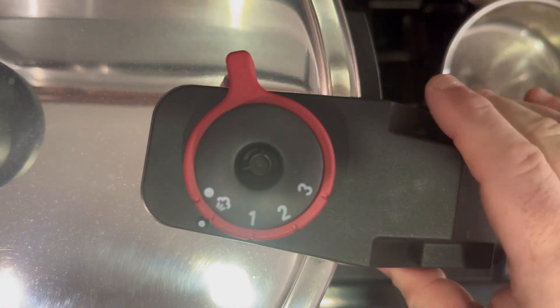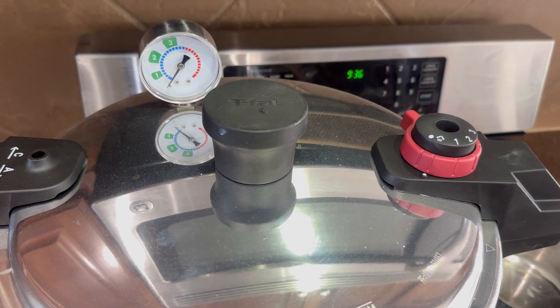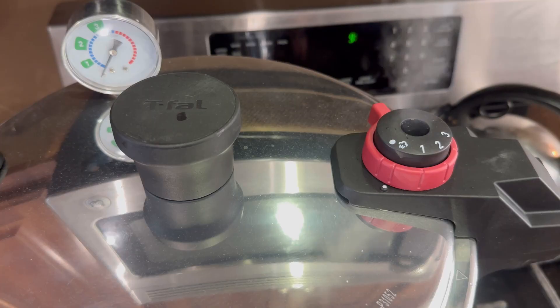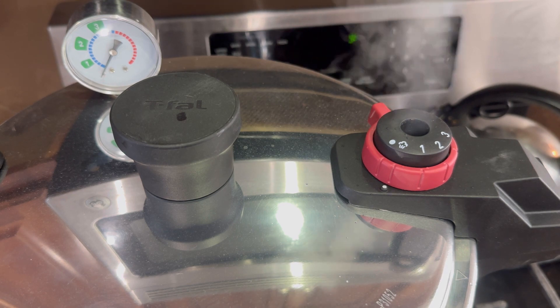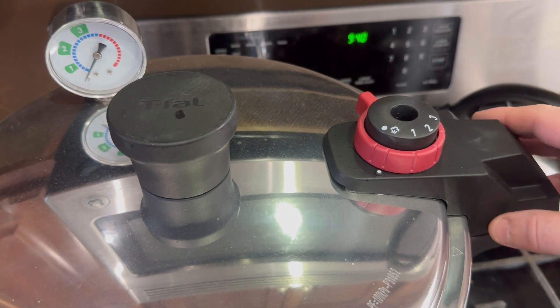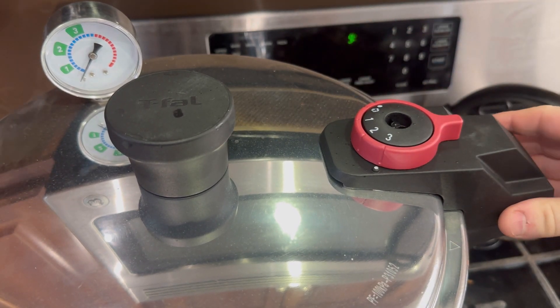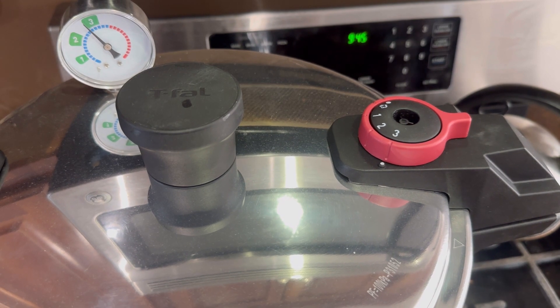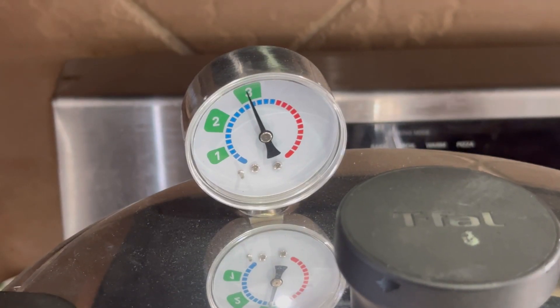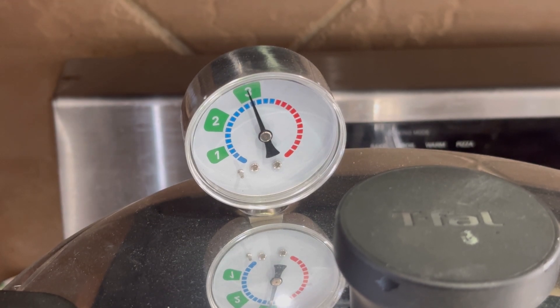My pressure pot doesn't have a PSI gauge on it — I know that's not ideal but I'm learning and this is what I started with. Since it was preheated it heats up pretty quick. You get a nice flow of steam coming out, which means it's getting ready to be set to the correct level. I flip the gauge to three — which is 15 PSI — and I check my lock to make sure the lid is locked in place before I engage that setting.